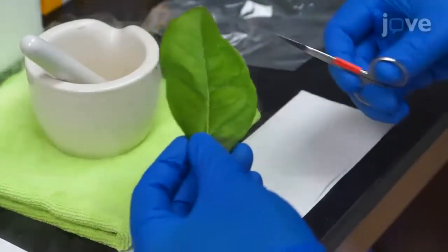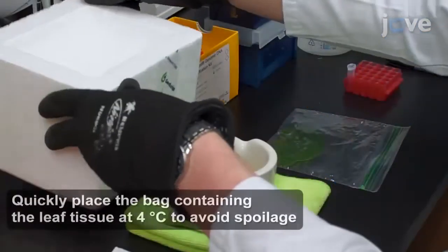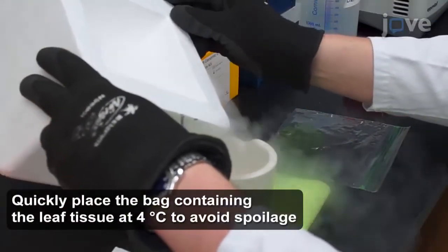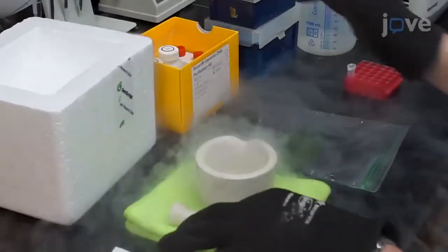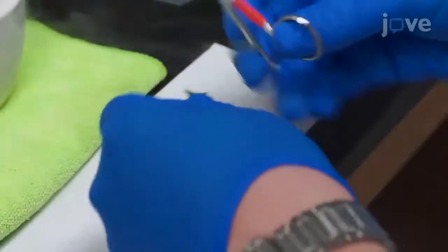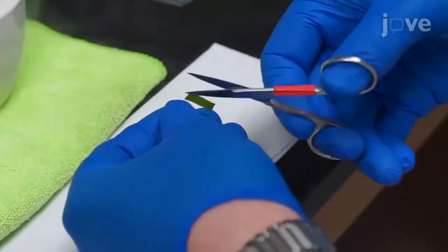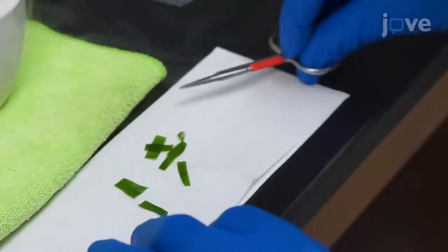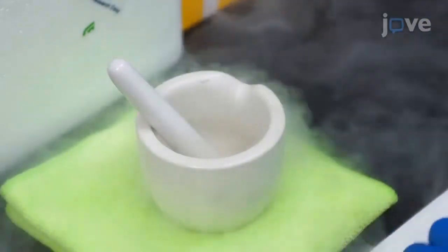First, use clean scissors to cut a whole fresh leaf from a citrus tree and place it in a clean plastic sandwich bag. Then, chill a mortar and pestle by adding a small quantity of liquid nitrogen. Next, use the scissors to cut small pieces of the leaf tissue approximately 1 square inch in size. Place the leaf pieces in the mortar to freeze them immediately.